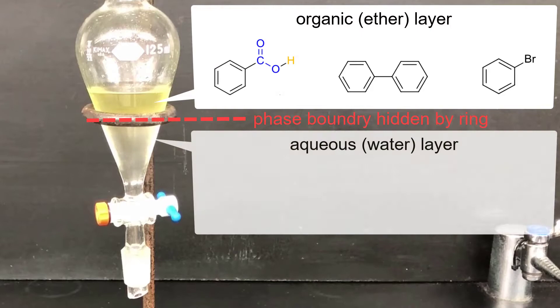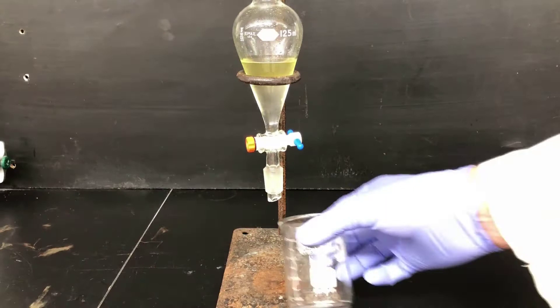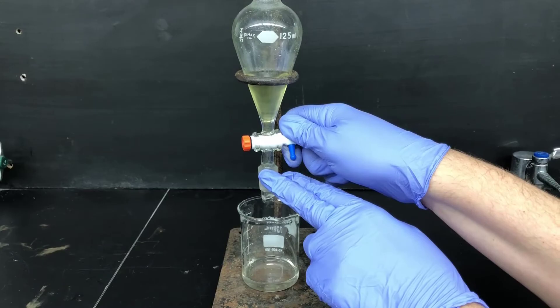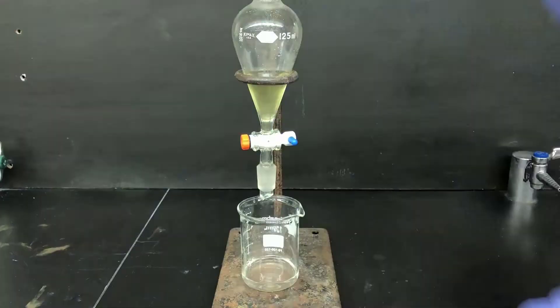Now I'll drain the aqueous layer out the bottom and discard it. That'll leave the organic layer in the separatory funnel, which contains the desired benzoic acid along with the organic soluble impurities. Keeping the layers straight in this experiment is a particular challenge, so to make sure I don't make a mistake and throw away the wrong layer, I'm going to label this container as aqueous waste.